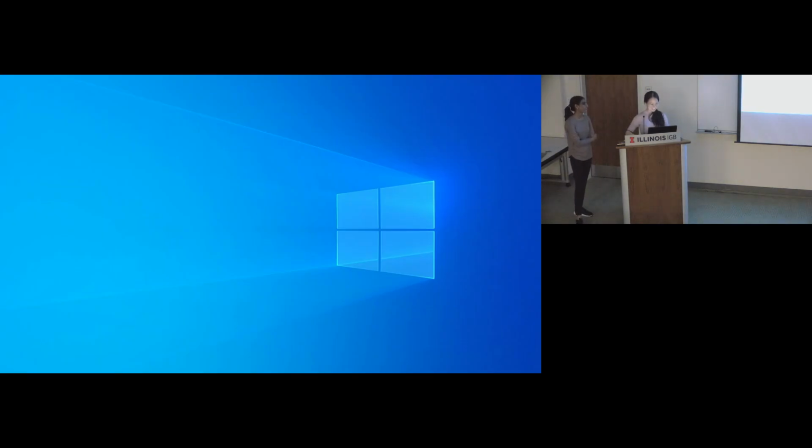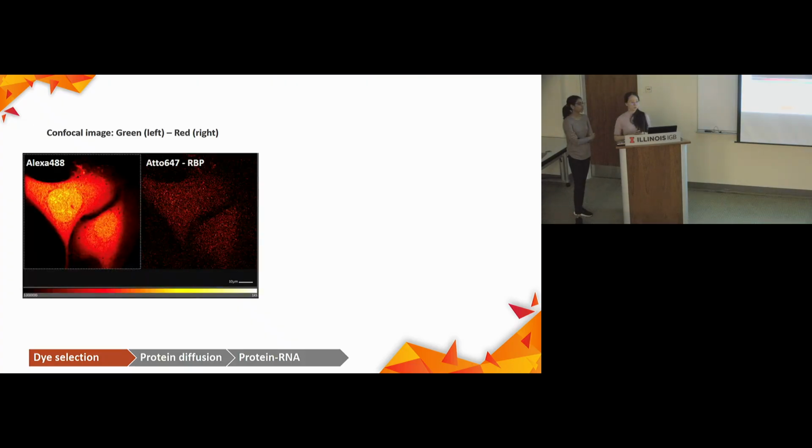So I do know a lot of tracers are sticky. Do you know, do they stick to the basement membrane of the cell, or the cytoplasm, or any albumin? We don't use this dye other than for MINFLUX, so we can't give you a very accurate answer, like whether... we didn't test, because once we know that it doesn't work, we just trash them, right? So, yeah, I think Gloria might have better experience because she worked with the dye.